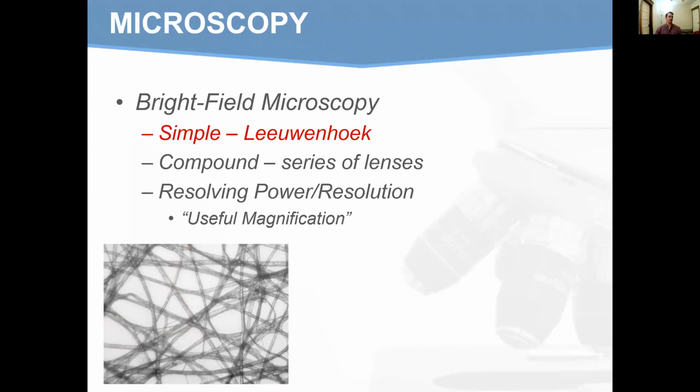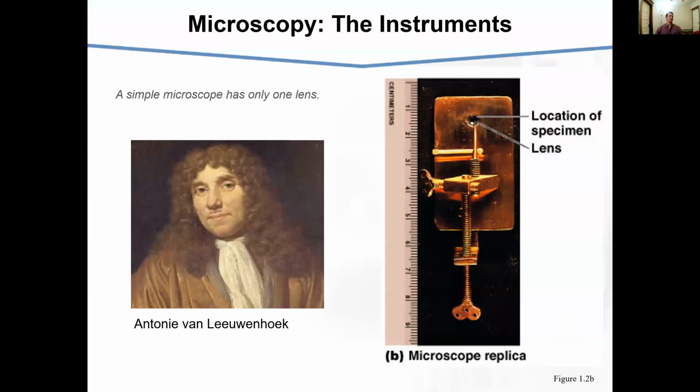This is a standard microscope. You guys will be using them, and it is used in biology, cellular biology, and microbiological studies. So those of you signed up for our practical sessions, you will be using bright field microscopy for the most part.